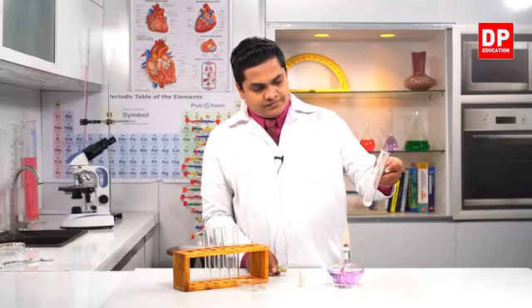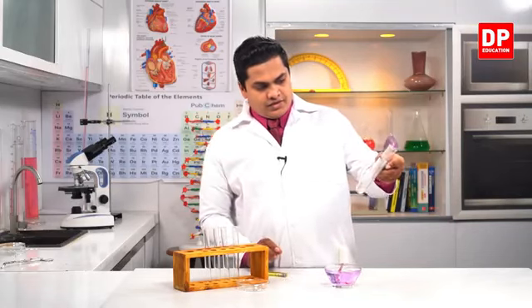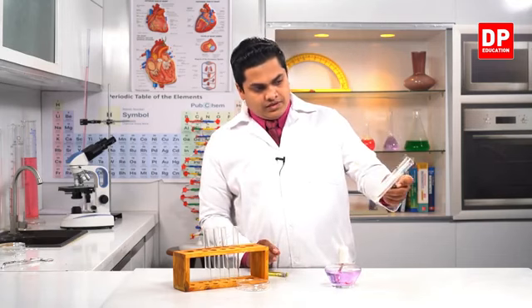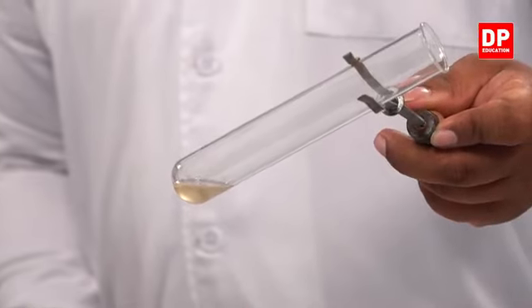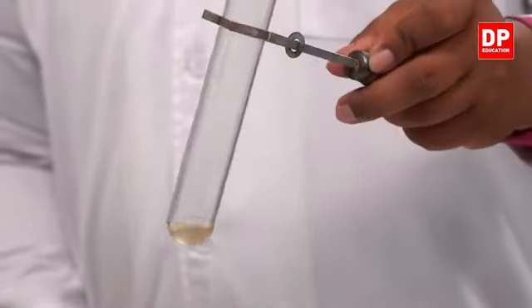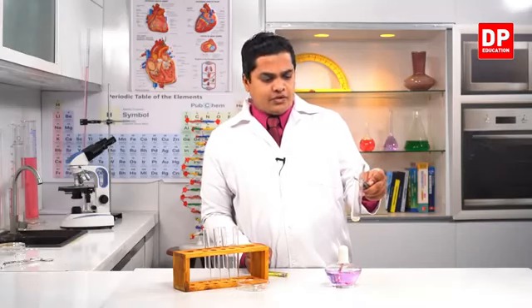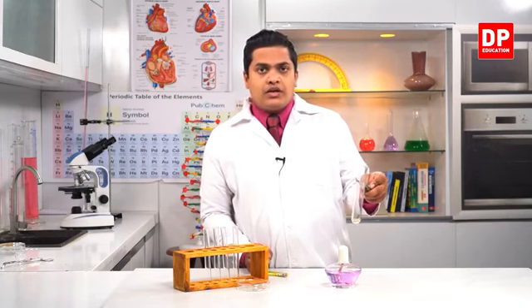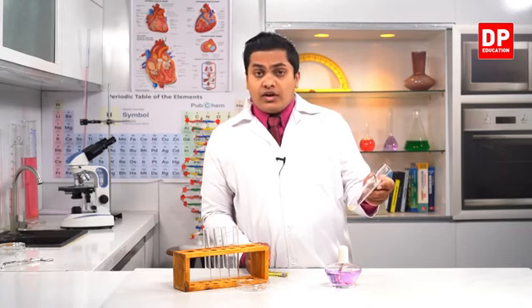Right. So here you can observe the liquid form of the wax, right? Now what I'm going to do is keep this system and allow it to cool. So what will happen when this liquid wax cools? Let's observe.